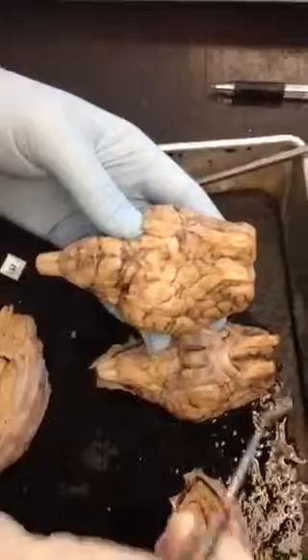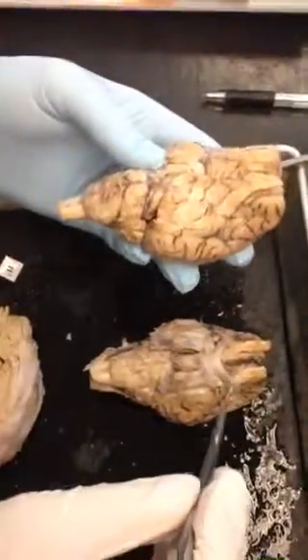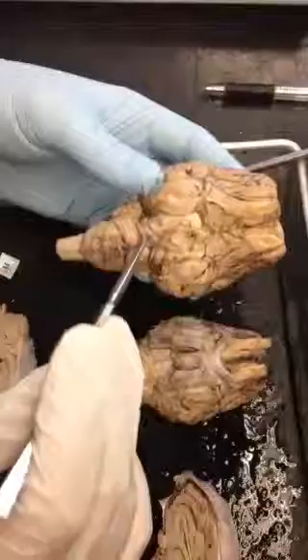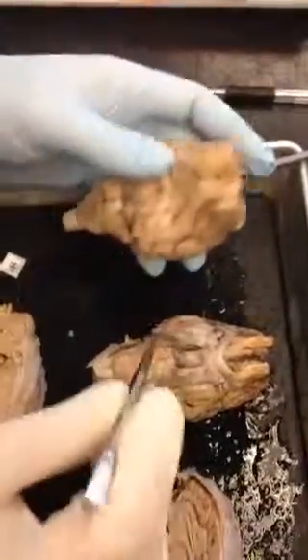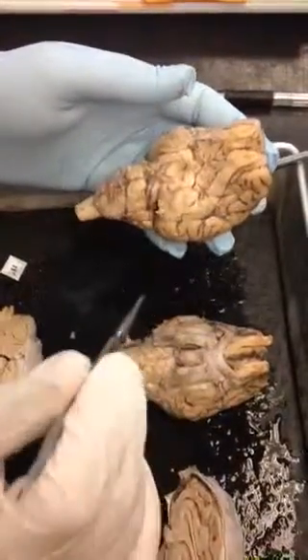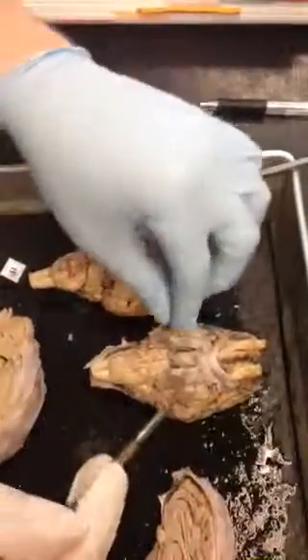So remember, we already did a couple of them, right? What's this? Just the olfactory, number 1, number 2, number 3, number 6, abducens, number 5, trigeminal. Tri, 3: it's a nerve that splits off into three parts, and you can see it on here.